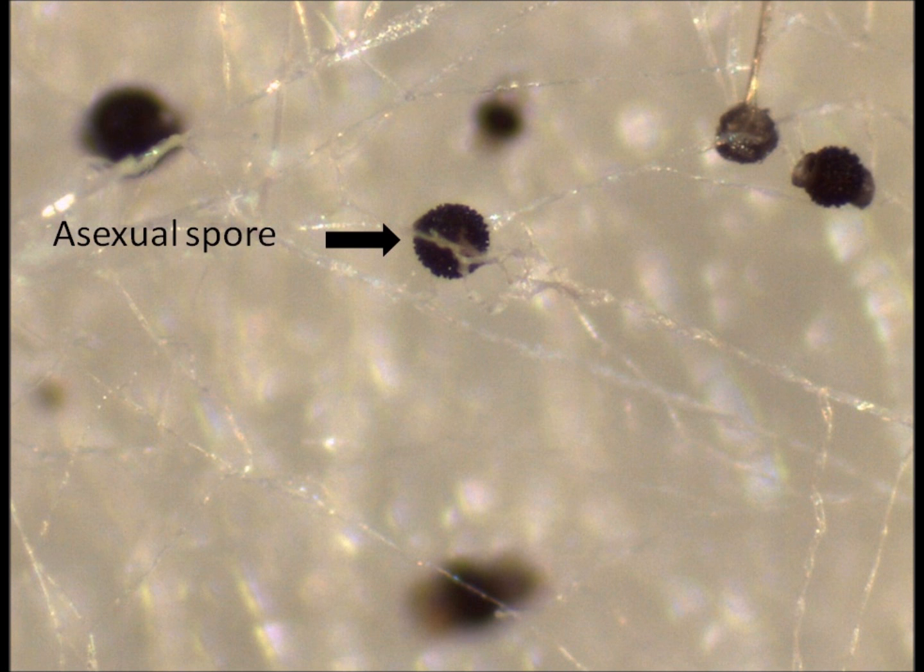Now the second picture is the same shot, only I've changed the focal plane using the focusing knob, and now you should be able to see this asexual spore. It's quite clearly different because it doesn't have those swollen hyphae.